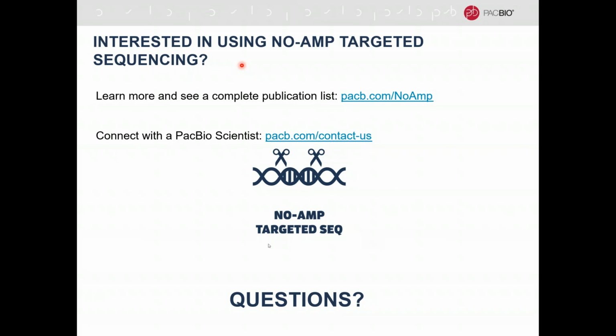There is a question about, have you also tried shorter fragments, for example, 2 to 3 kb? This is a good question because this might not have been obvious from the presentation. Even though we focus on 4 to 6 kb insert sizes, that doesn't mean you can't capture the shorter repeat expansions that are under 1 kb. It just means that you have more of the buffer sequence.